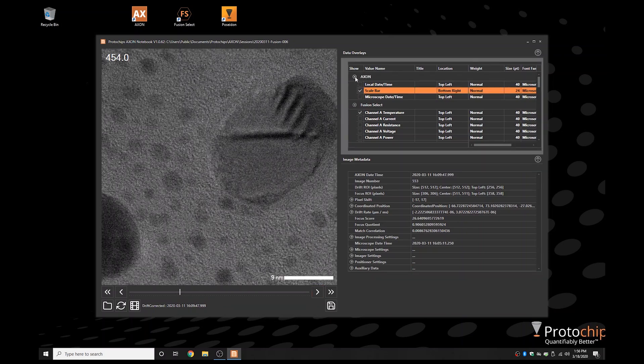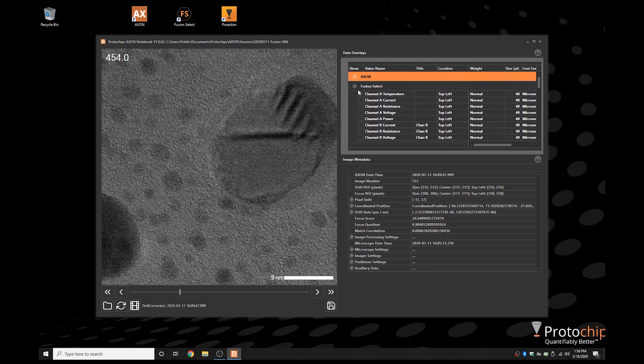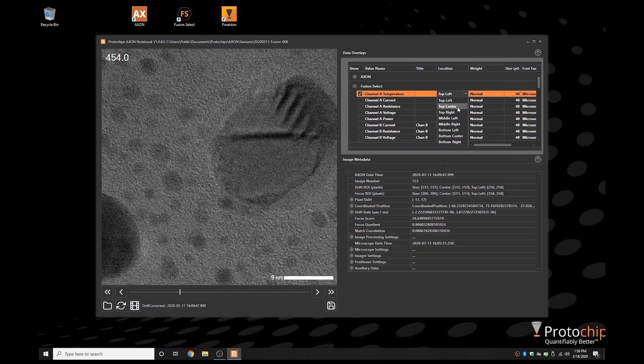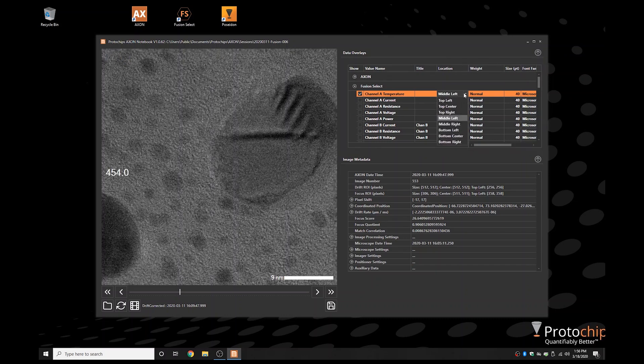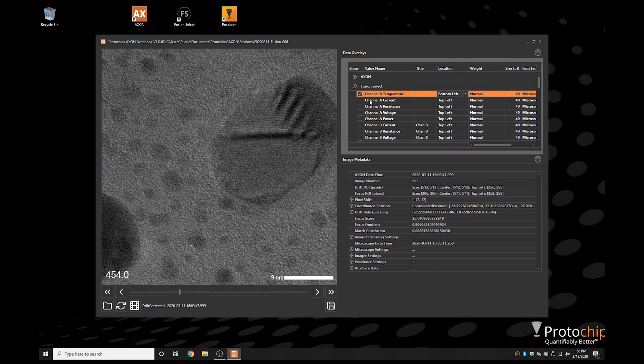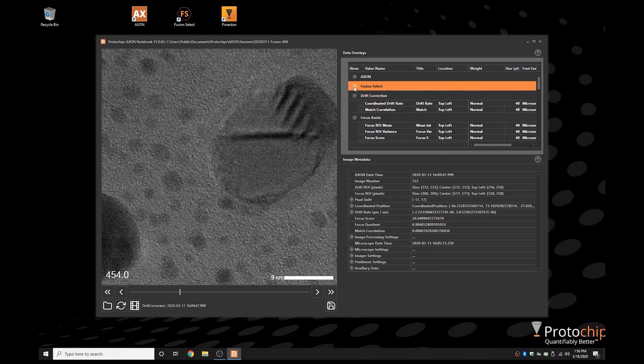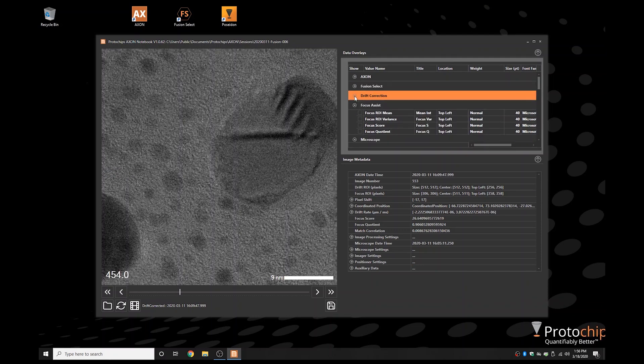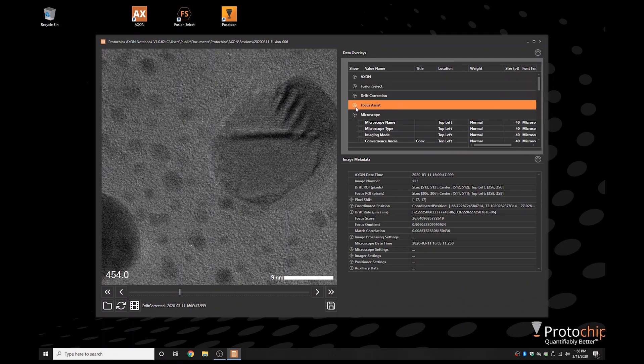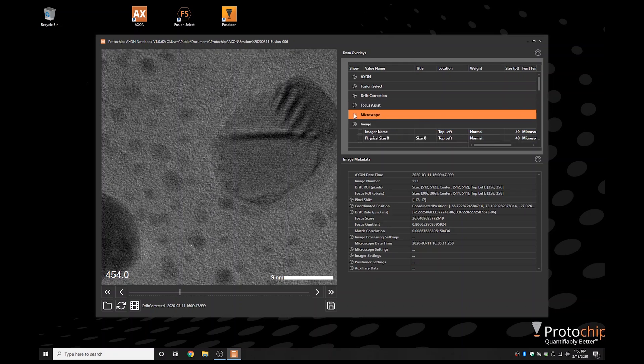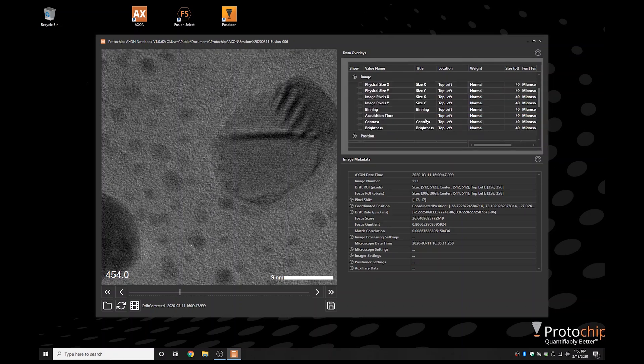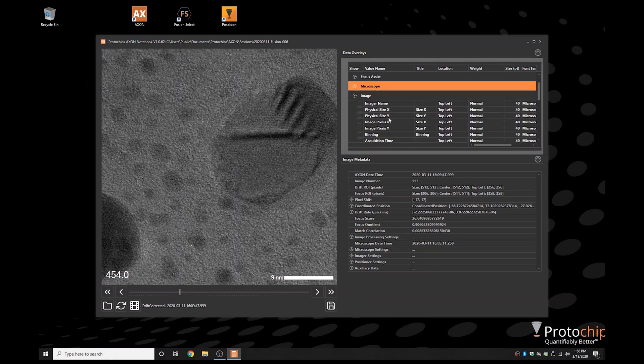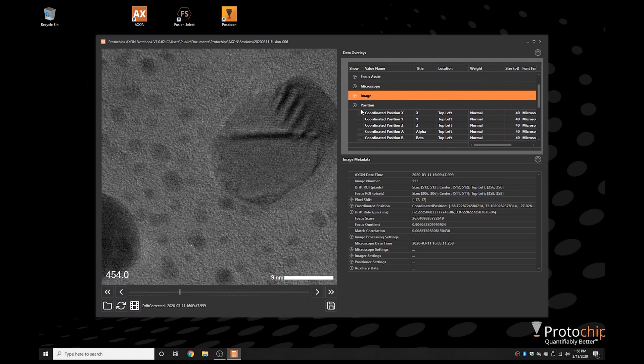During the capture of this data, Axon automatically embedded all of the operating conditions of the TEM column, the imaging detectors mode and settings, and all of the control and feedback information for any Protochips in situ systems that were in use. Even if you don't own a Protochips in situ system, all of the other metrics mentioned are synchronized for you by Axon.